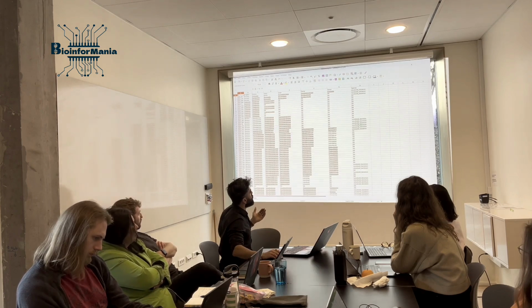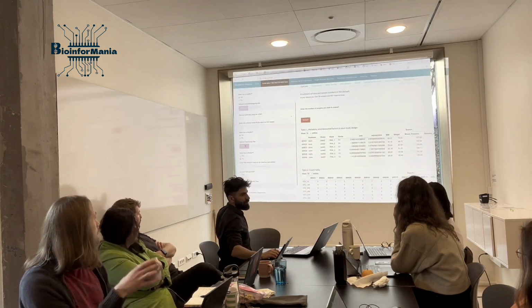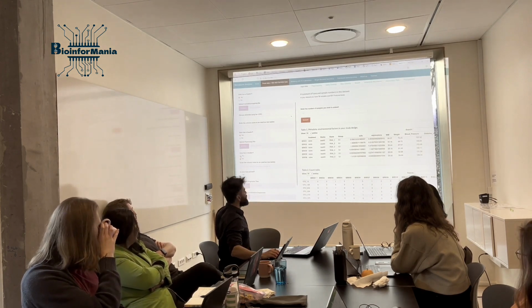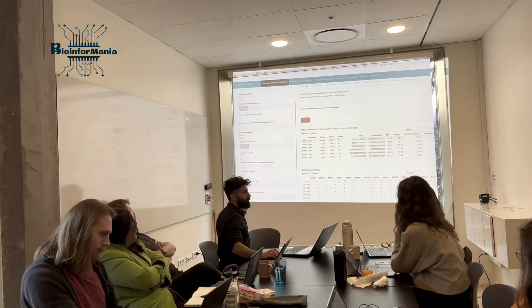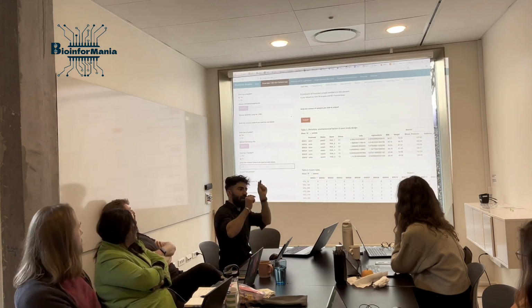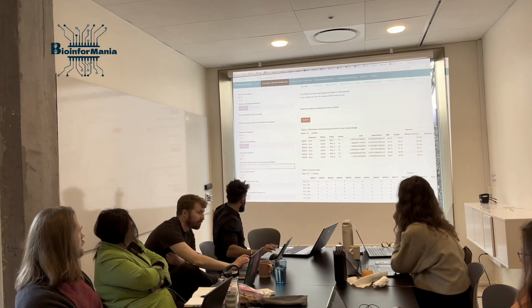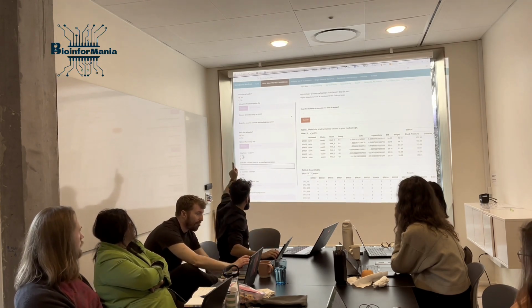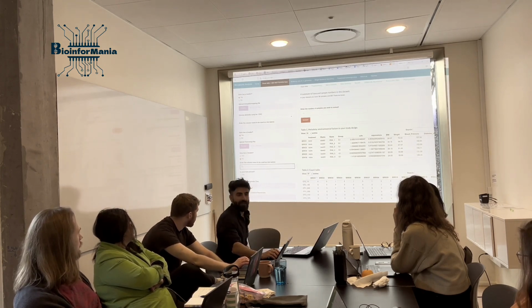So what we do here, we need to specify. First and foremost, you upload your taxonomy data. Data has a header? Mine doesn't have. Maybe yours does. If yes, you need to know what column you should use for the OTU names, the first row, okay? And that's what you put in. My data doesn't have a header, and by default, if it doesn't have a header, you just put x1, okay?